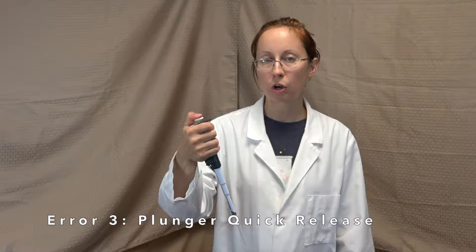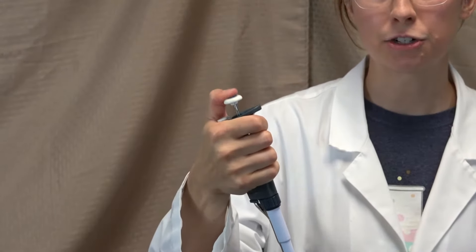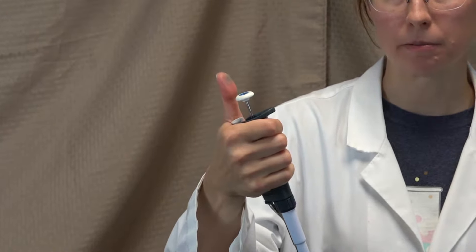Next, remember to always let the plunger up slowly. If you let it up too fast, you're likely to draw an air bubble up into the pipette tip.